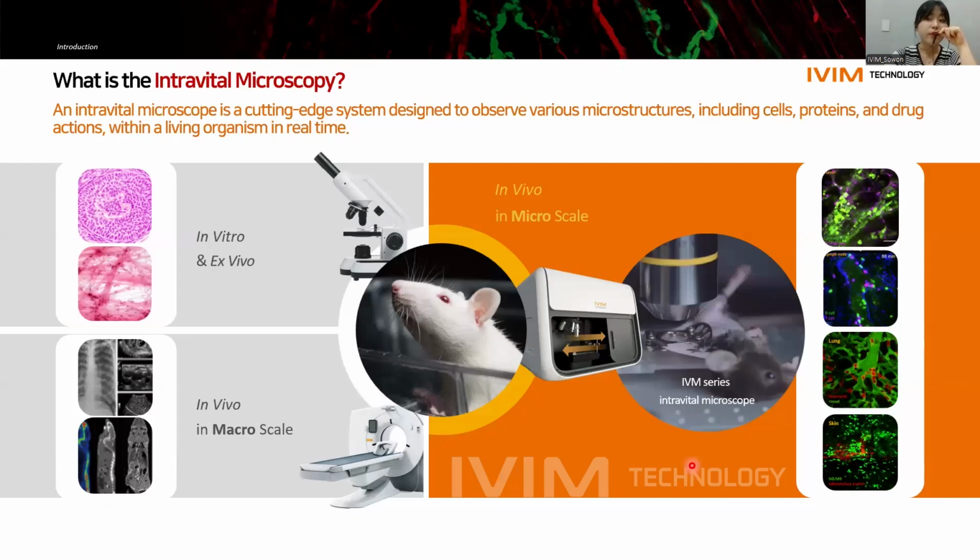First, I'll briefly introduce what intravital microscopy is. So intravital microscopy is a high-resolution imaging technique that allows for the real-time observation of cellular dynamics within a living organism. It helps researchers overcome the long-standing limitations of traditional imaging methods.